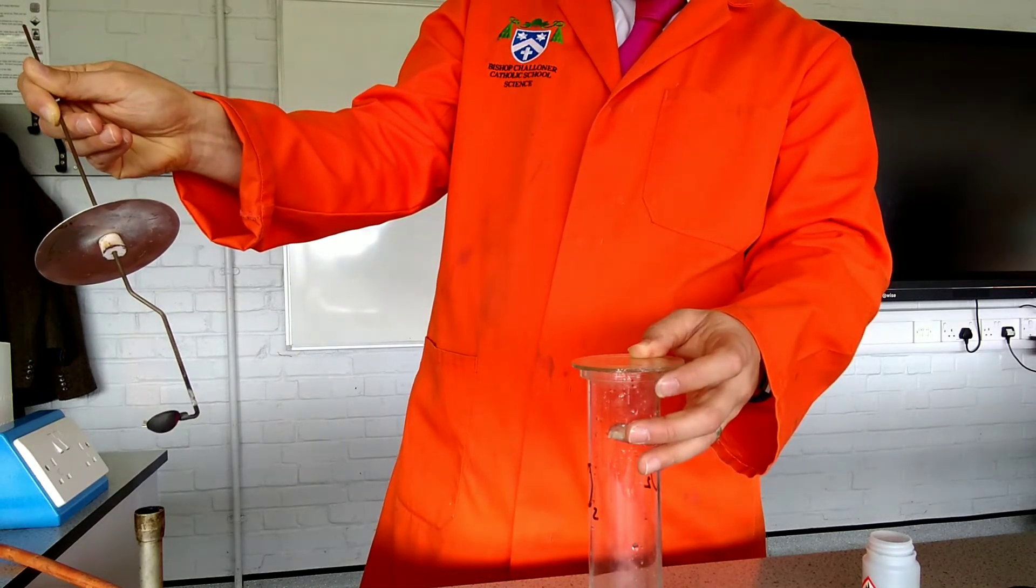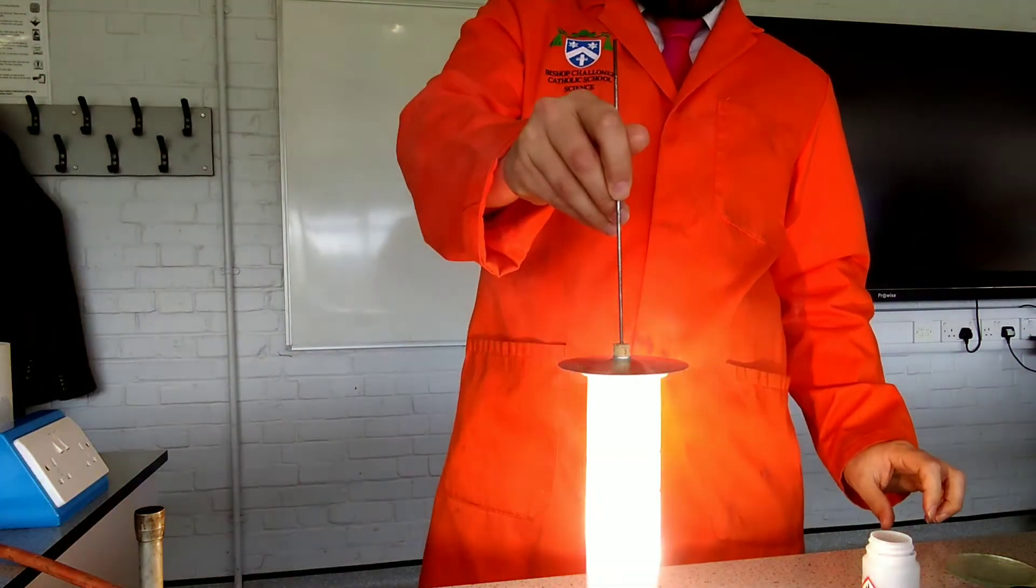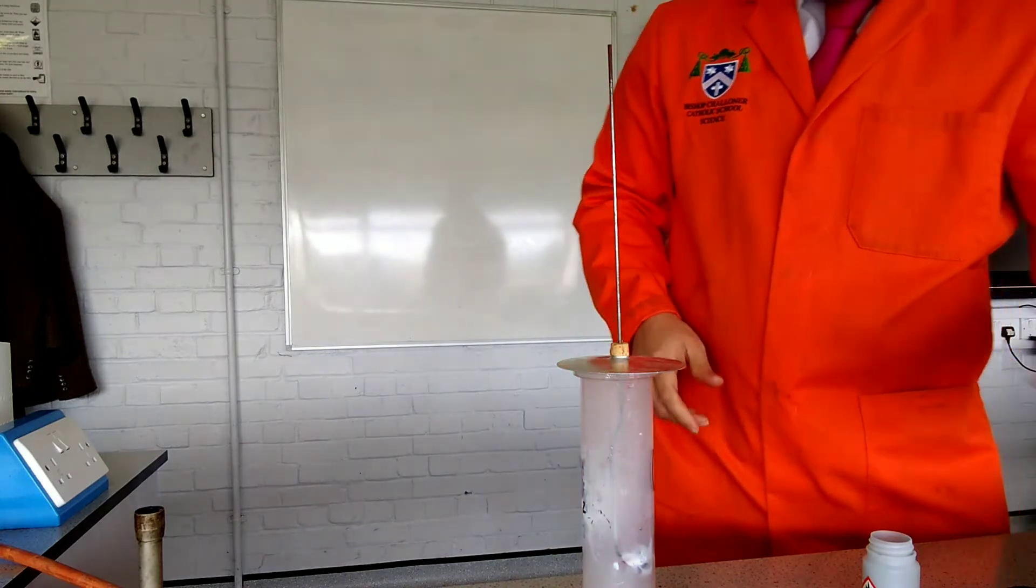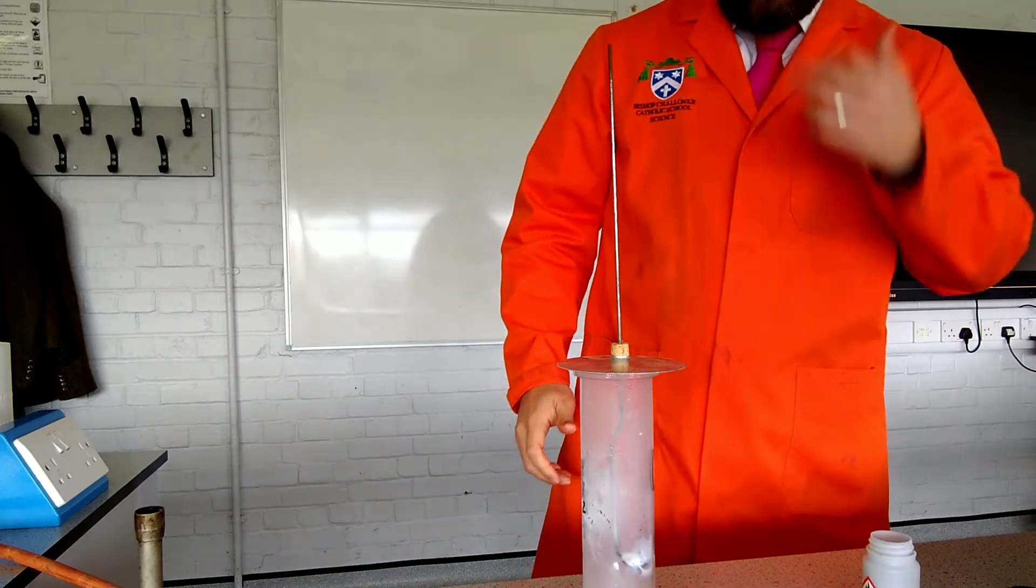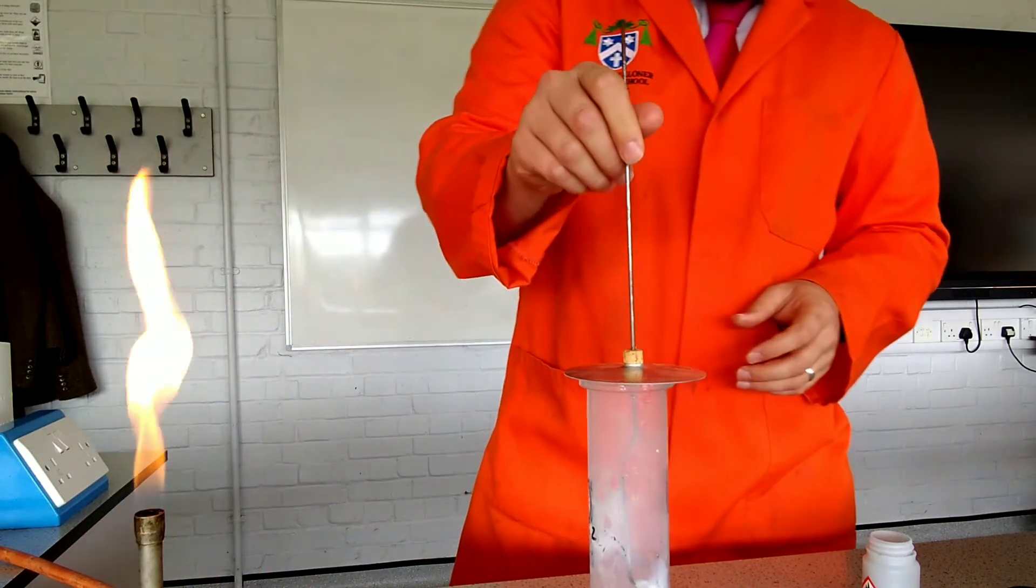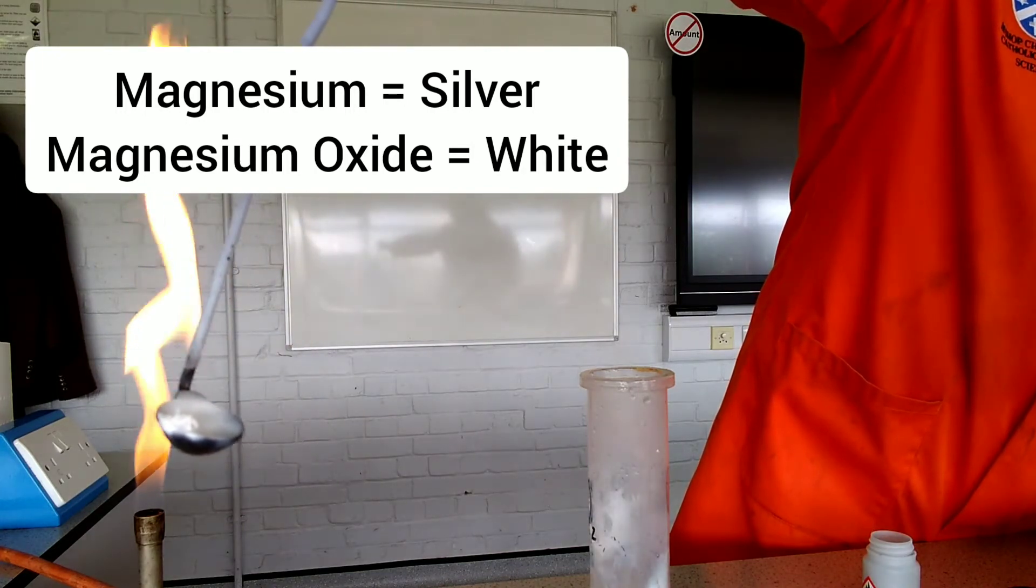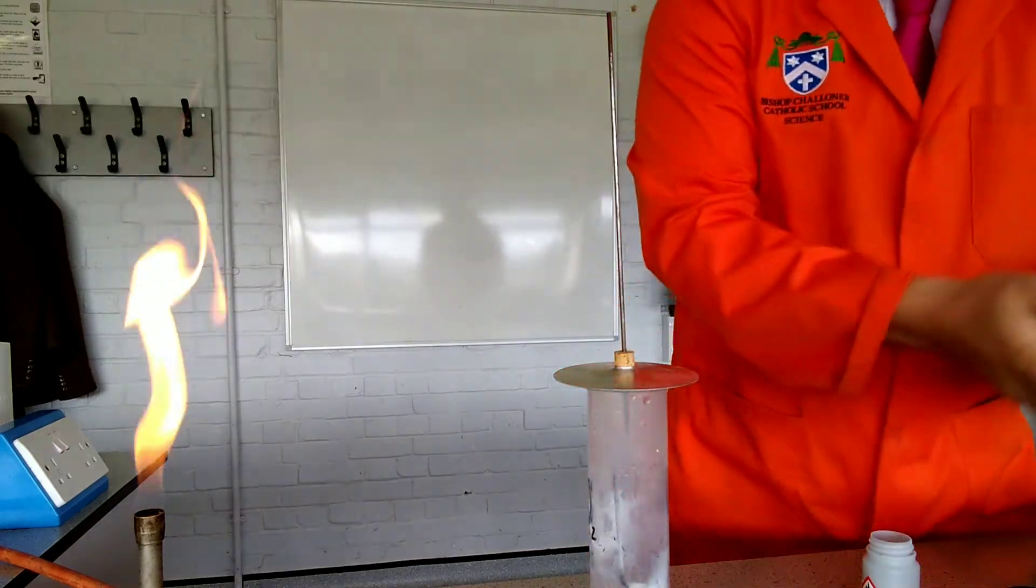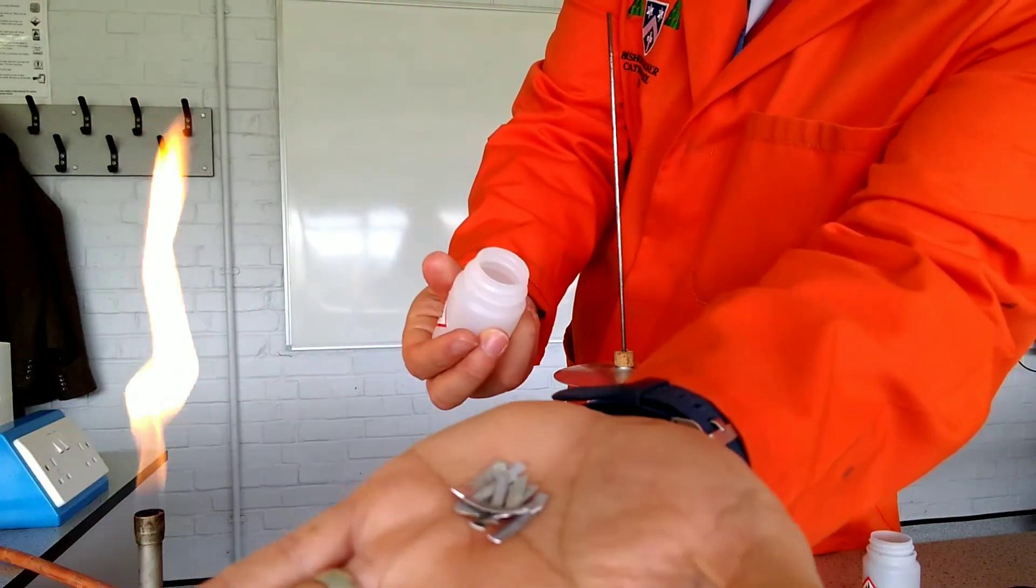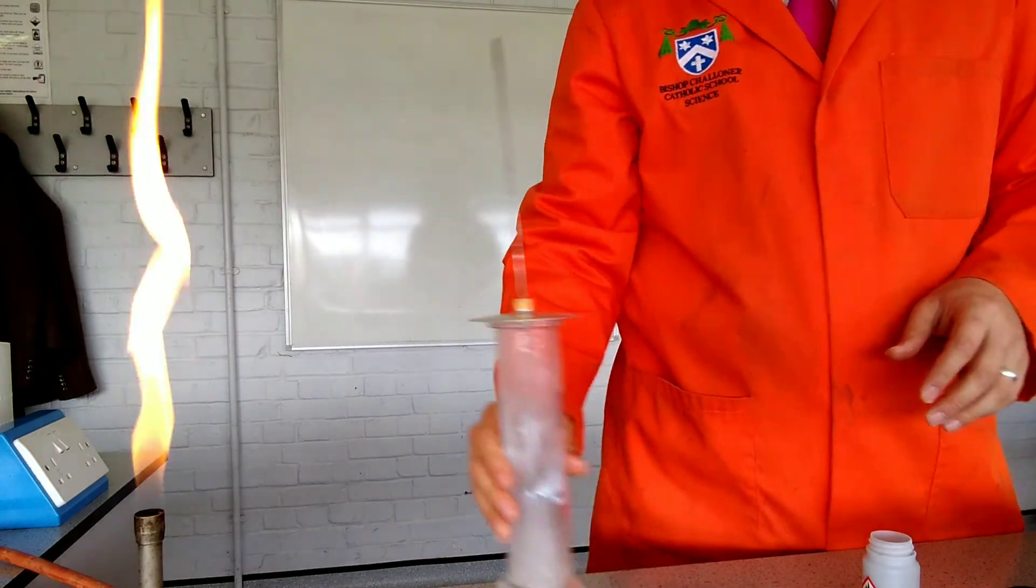So as soon as I get this to light, I'll put them into the... So just about there. And that brilliant white light there just shows you quite how reactive magnesium is when it reacts with oxygen. So that's magnesium and oxygen. Now, if I turn this down, I might just be able to show you, that's fully reacted there. So that is, you can see a whole lot of white magnesium oxide. It looks very, very different from the original magnesium ribbon, which is both silver and really, really shiny. So that's magnesium ribbon before it's been burnt and afterwards we get this lovely white magnesium oxide.